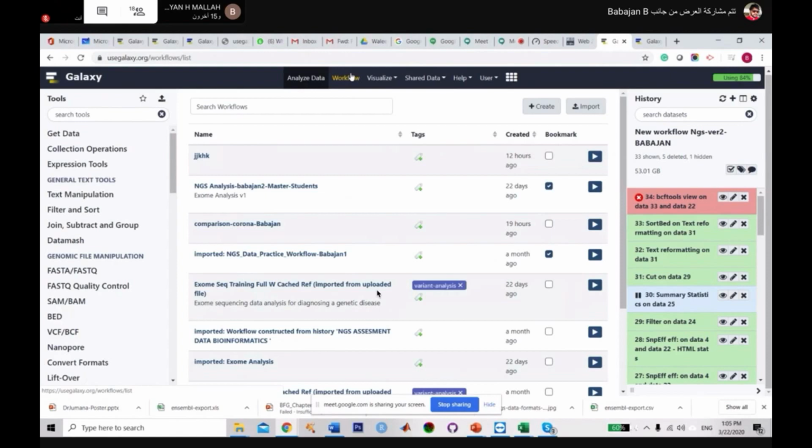As I told you here, first of all, we will get a BCL format file. From BCL, we will generate a FastQ. From FastQ, we are going to generate the SAM or BAM file. From the BAM file, we are going to generate a final version called the VCF format file. Okay, these are the steps. We already know this one. So we have to create a pipeline.